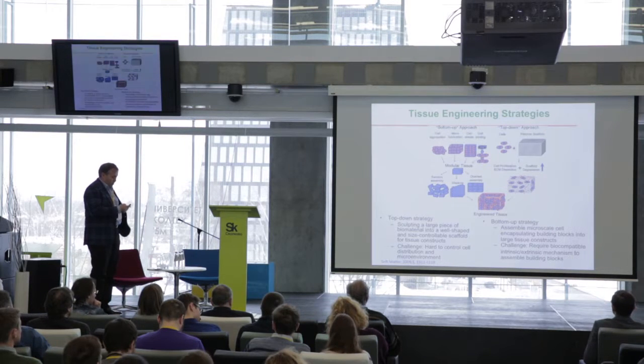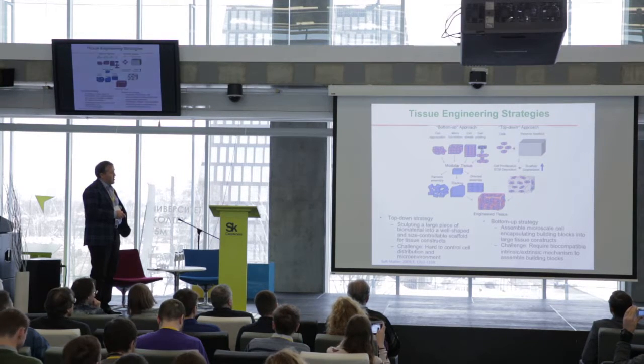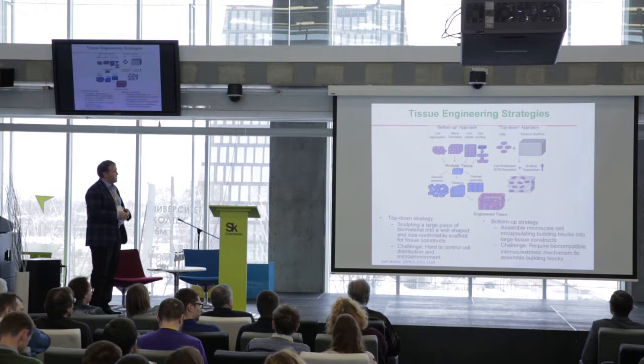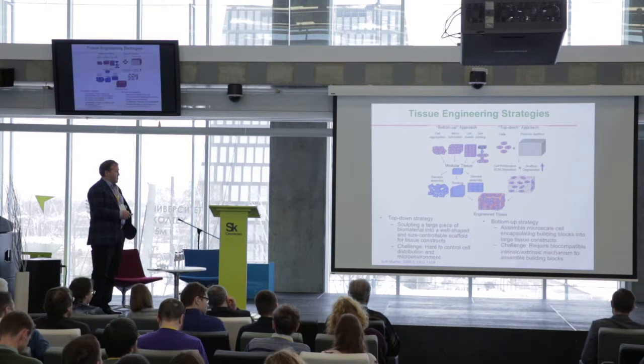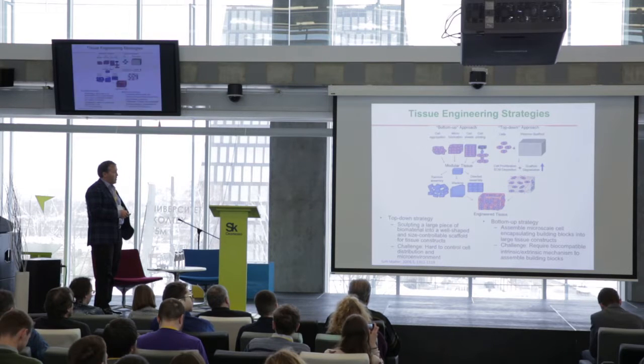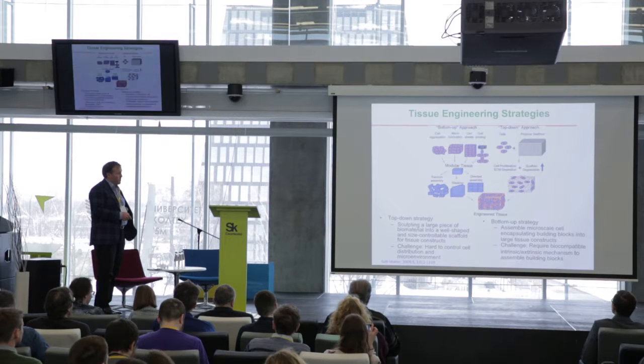technologies to build systems that pull together either microgels, spheroids, tissue spheroids, and using self-assembly to create additive biomanufacturing technologies. One of the directions that we have taken has always been to self-assemble these micro-constructs that we first engineer to make functional, and then bring them into more complex and larger constructs in a way that we could build complexity.